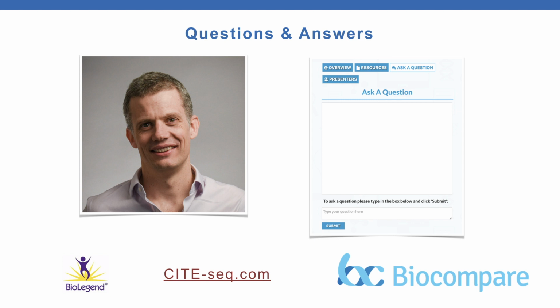The poly-A, the TotalSeq-A type reagents will be compatible with any method that uses poly-T to capture cells' mRNAs. So we've personally used them on Bio-Rad and Illumina's DD-seq. I'm not sure how much that's being used these days. And we know people who are using it in InDrop as well, and we've done plate-based type methods as well.